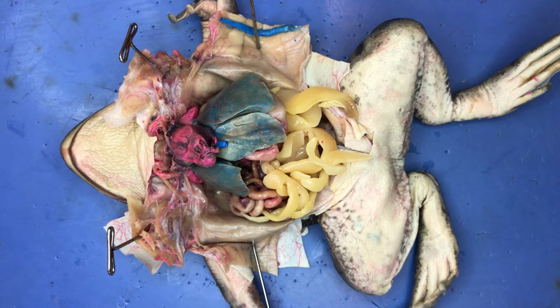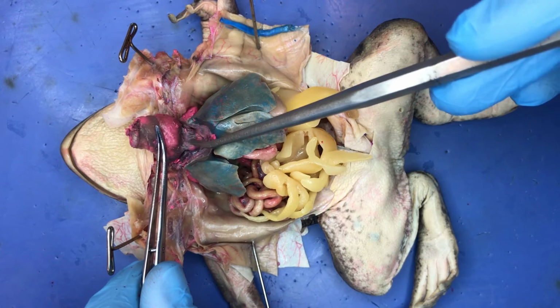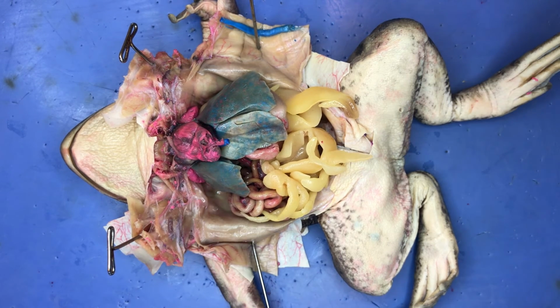Now that we have removed the pericardium from the heart, we can see the delicate wall of the triangular sinus venosus that lies dorsal to the heart. The sinus venosus receives deoxygenated blood from the liver, the paired anterior vena cava, and the posterior vena cava.